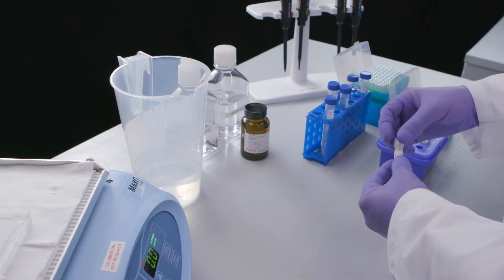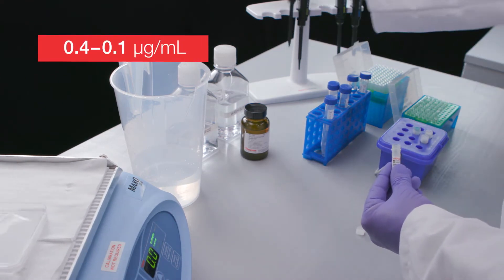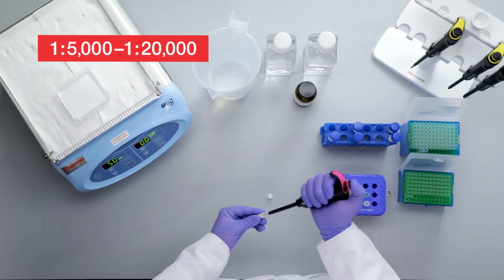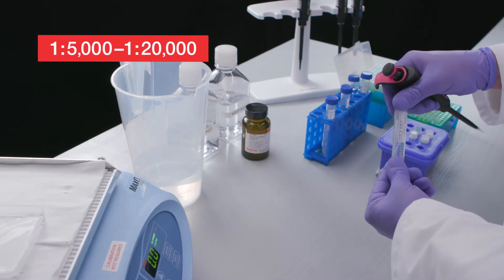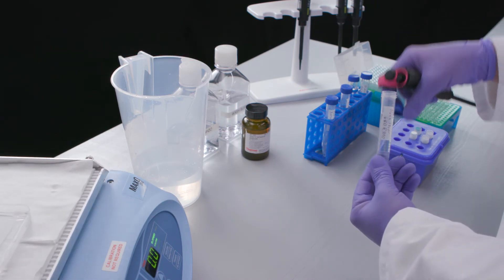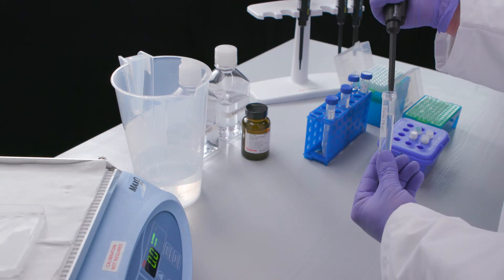Prepare dilutions of the conjugated secondary antibody of 0.04 to 0.1 micrograms per milliliter, or 1 to 5,000 to 1 to 20,000 in an appropriate volume of wash buffer. Alternatively, the secondary antibody can be diluted in blocking buffer. Detergent can now be added if needed.